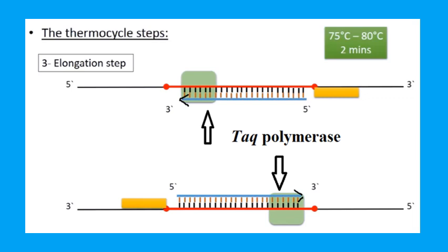This step consumed about 2 minutes at temperatures from 75 to 80 Celsius degrees.